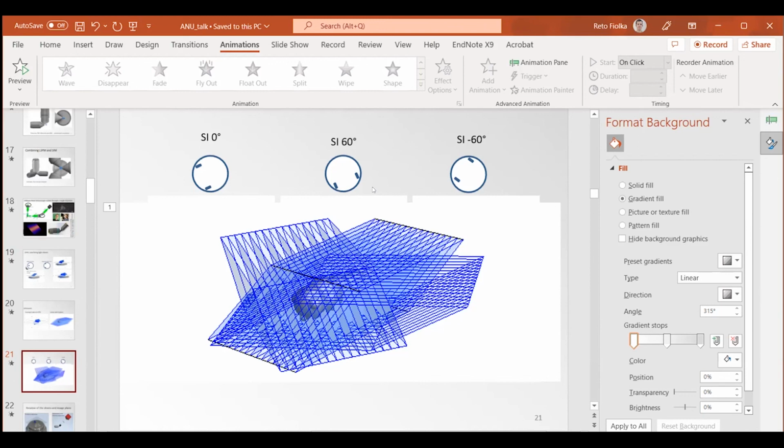But we figured out some sort of alignment protocol. We treat the image rotator as a separate module that you can take out and put on a separate optical table, and place some pinholes a meter away on each side and align so that a beam that goes straight in doesn't deviate by much over, say, a meter of propagation. That way we dial it in so that it has a very small angular error. And then it works, at least in our hands.